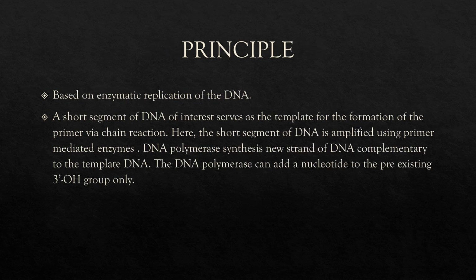So what is the principle behind this? Actually, this is based on enzymatic replication of the DNA. Here, a short fragment of the DNA of interest serves as the template, which via the chain reaction is amplified using primer-mediated enzymes. The DNA polymerase synthesizes a new strand of DNA complementary to the template DNA, and then the DNA polymerase adds new nucleotides, but only at the pre-existing 3-OH group.